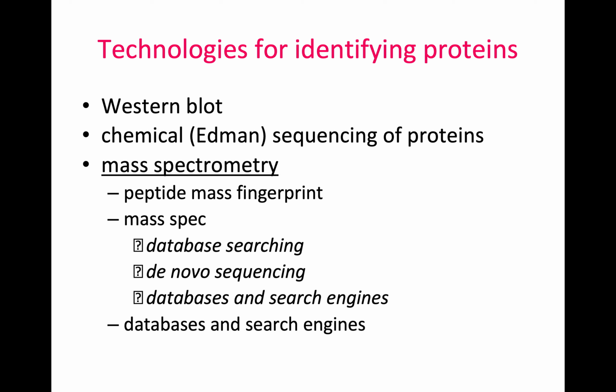So protein could be sequenced, even though you may have only heard of DNA sequencing. Previously, in the old ways, protein was sequenced using chemical sequencing called Edman sequencing. Nowadays, proteins are sequenced using mass spectrometry. Mass spectrometry is also what we do when we want to identify peptides by mass. We call it peptide mass fingerprint, kind of like your normal DNA fingerprinting.